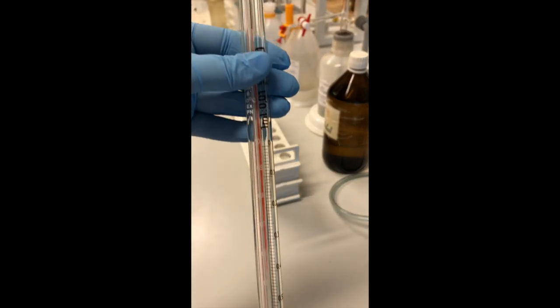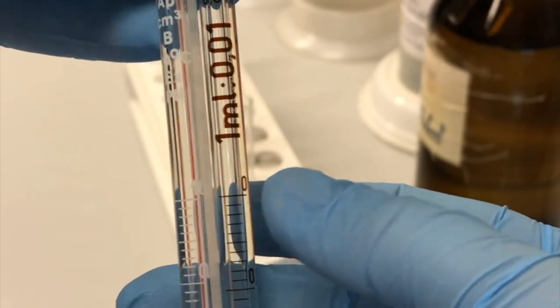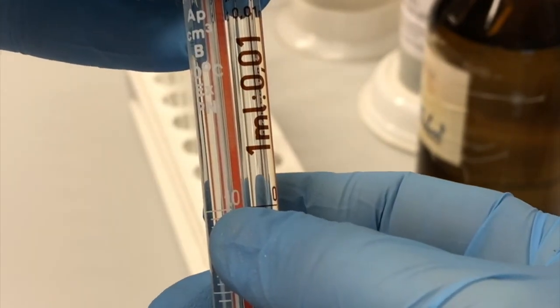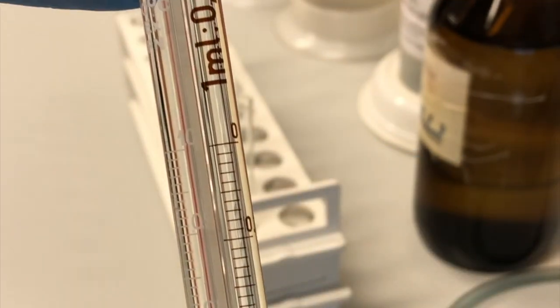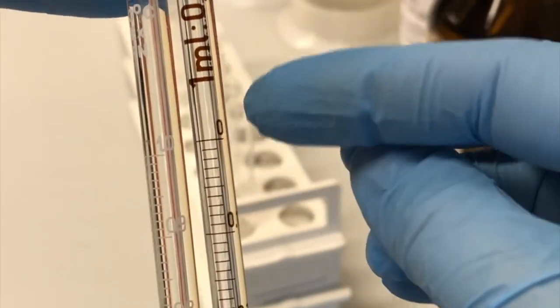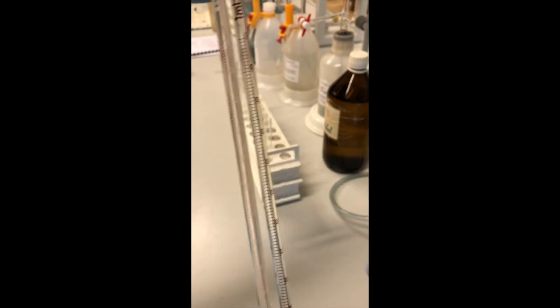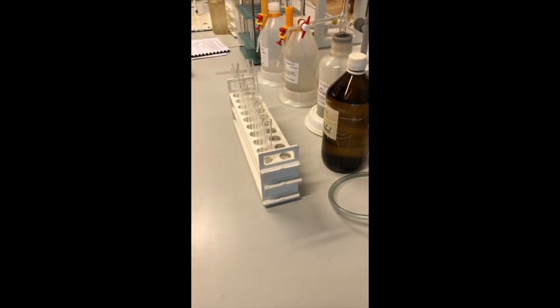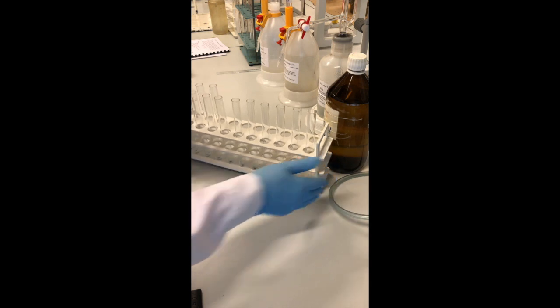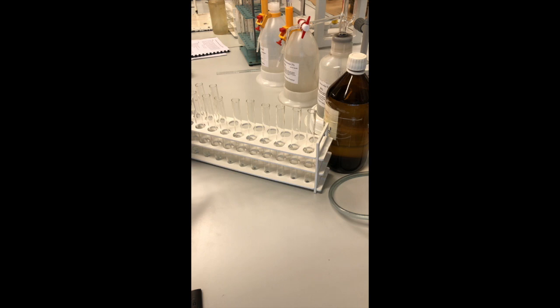There are two types of pipettes. When you look at the scale, one has 0 on the top and the second has 1.0 on the top. So the important thing is that when you want to use this pipette, you have to start from the top. You need to have a full pipette. When you want to use this one, you usually take as much as you need. You put the standard solution from 0 to 0.9.